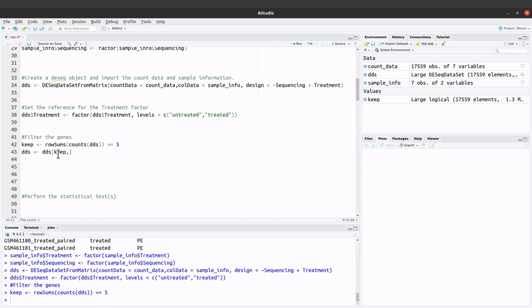Now with the 5 I selected, it's based on the original DESeq2 tutorial, but the criteria for when you have to decide that yourself. You can read papers and publications to see what was used and then try to use that. So this is a number that I chose from the DESeq tutorial. There's no reason per se for choosing this number. I just use that because I saw it in that original tutorial.